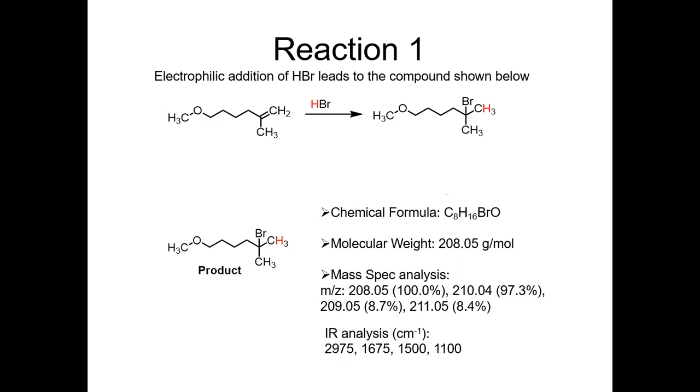Wait, what do you mean? Oh, in the infrared, like what functional group shows up at 2975? If it was a really raggedy, jagged looking, strong stretch at 2975, what would that be? Right, you see all these carbons in this alkyl chain, that's alkyl stretching.